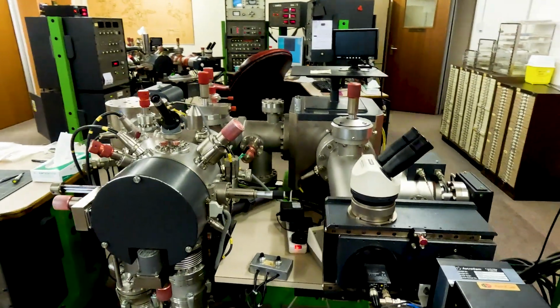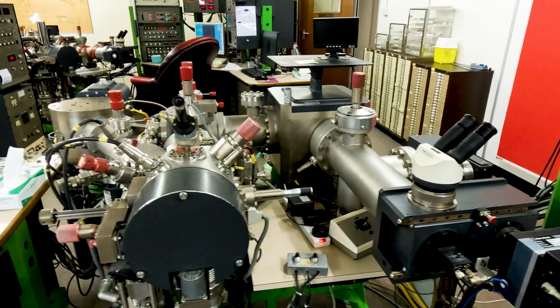The main objective of this project was to develop a methodology that could be used for the characterization of potential contaminants in superalloy materials using a technique that is primarily applied to the semiconductor industry. This project combines the strengths of LSA, which is SIMS analysis, and advanced microscopy, which is my speciality at WMG.